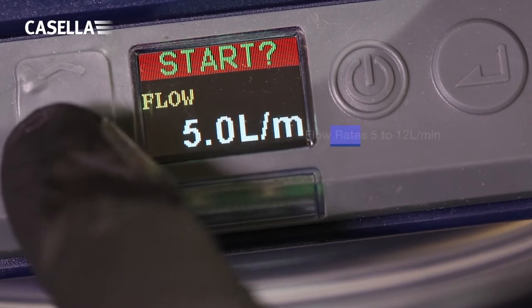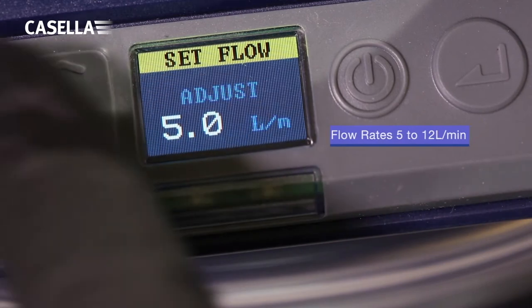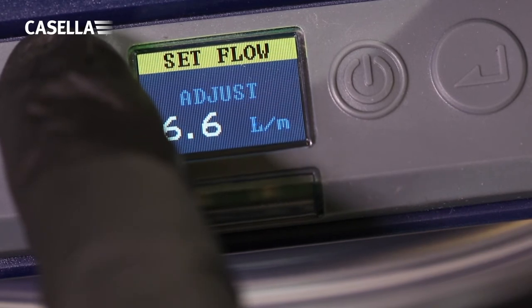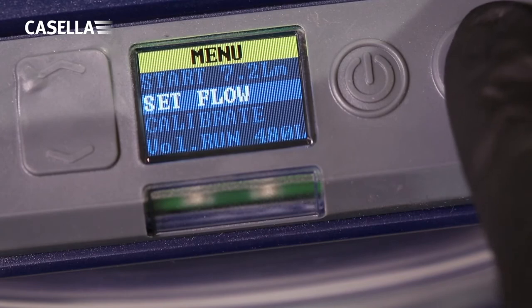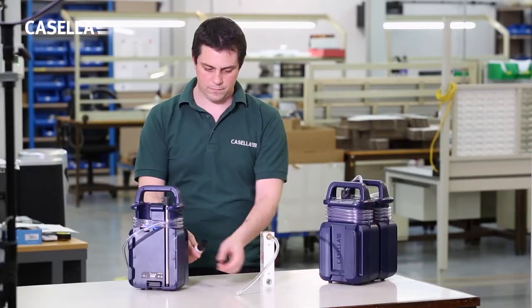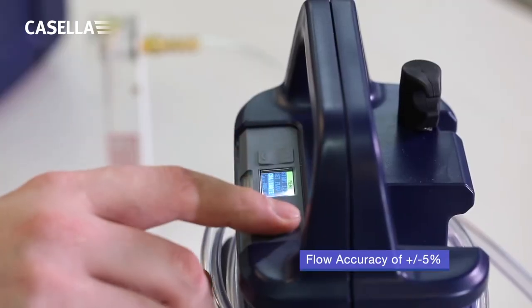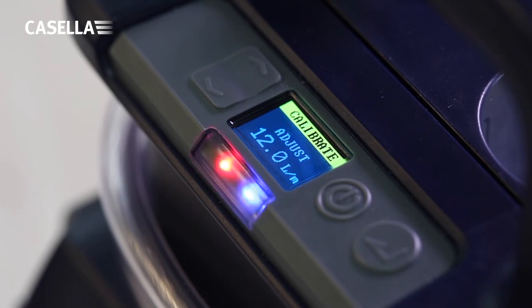Flow rates can be set easily to accommodate your application requirements. With an impressive back pressure capability enabling a wide range of filter media choices, the scrolling increments are in 0.2 litres per minute, making setup fast. The ability to calibrate the pump quickly using a simple rotameter means that you can verify the required performance and quickly set to save time on site.